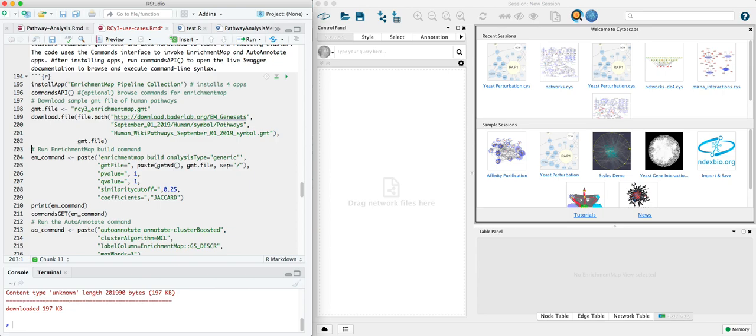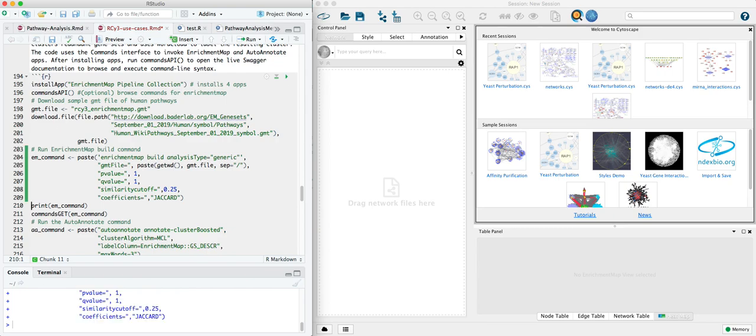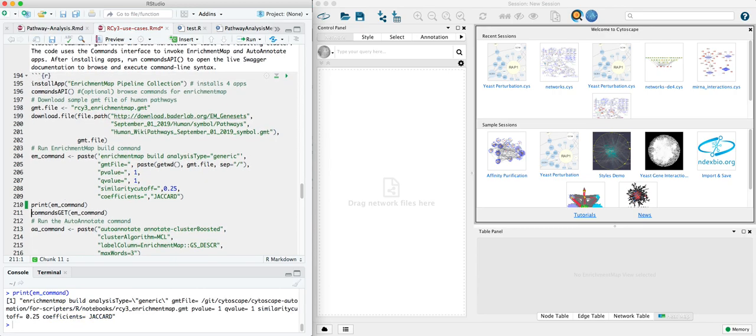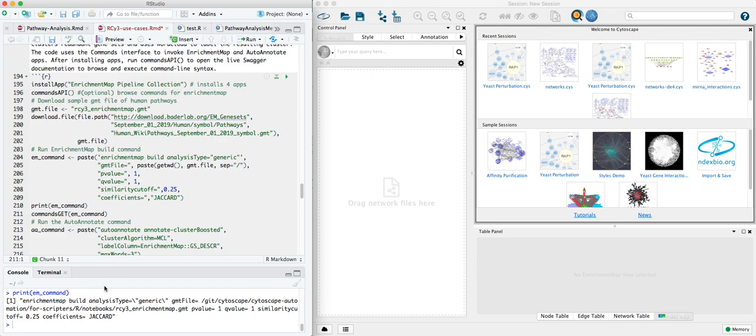This next line is the key line. It composes a command. It's the same syntax, command line syntax you would use running in Cytoscape directly. We'll go ahead and print that out. So it invokes enrichment map namespace of commands and a specific command called build. And then there are a number of parameters.